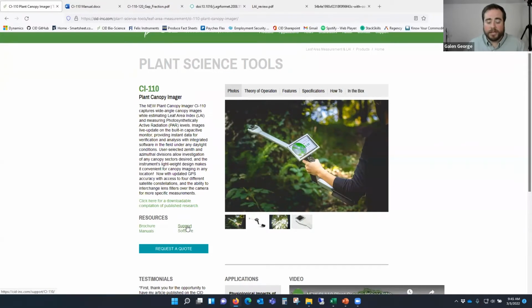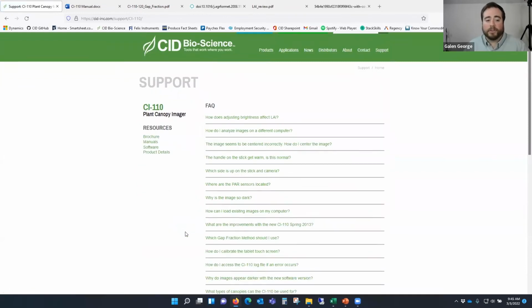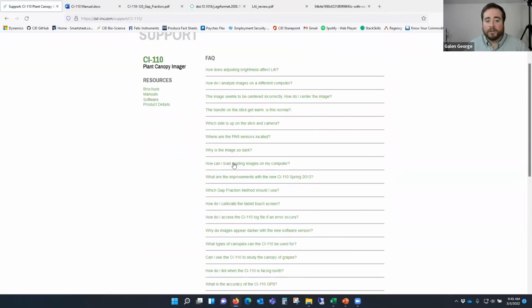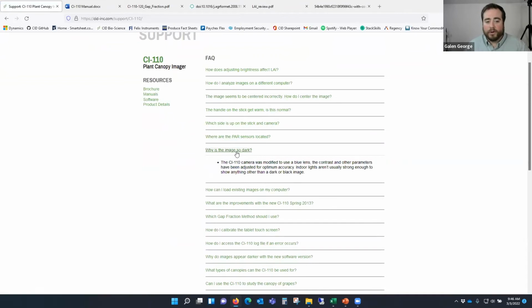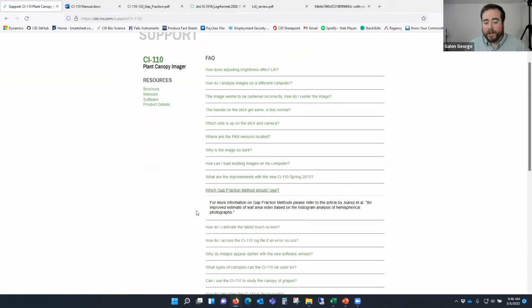So if I go to the support link, this is a very valuable resource with a lot of good FAQs. If you have a question about your instrument, a lot of them can be found here. So there's information for which gap fraction method should I use.